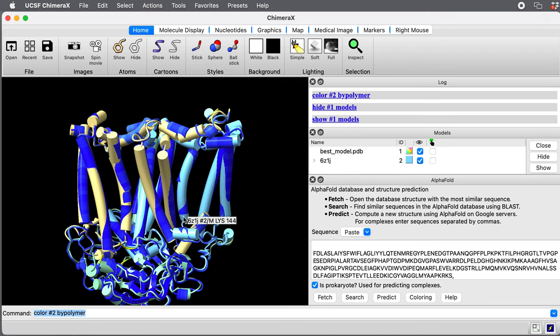This heat map can be very useful in deciding whether AlphaFold's prediction is a good one when you don't have an experimental structure. I'm going to be working on adding that to Chimera X, but it's probably not going to be in there until maybe January 2022. Thanks for listening.